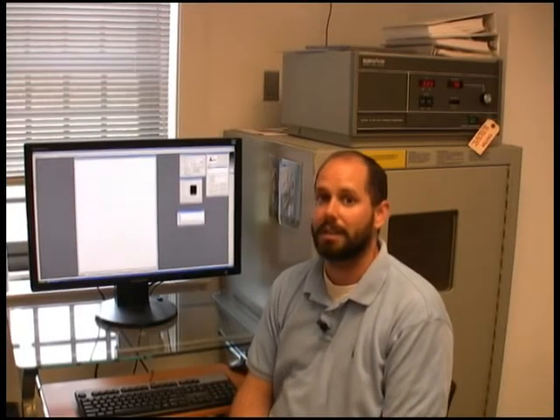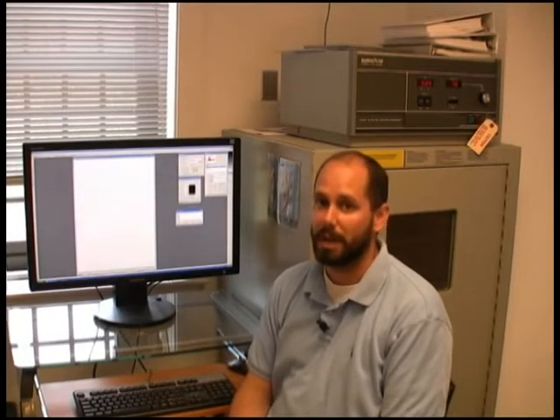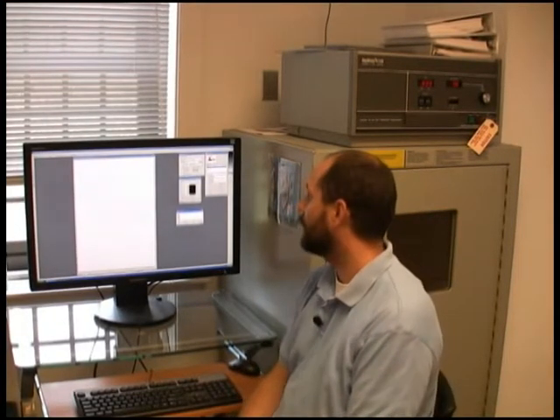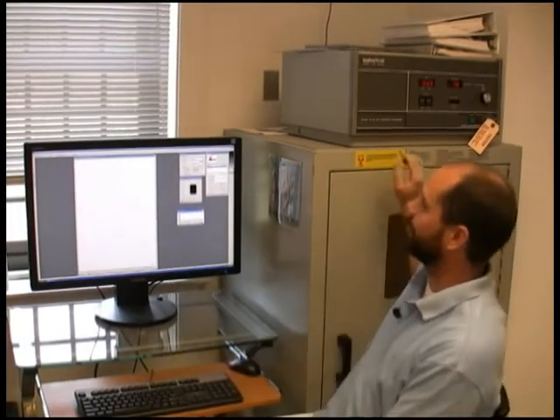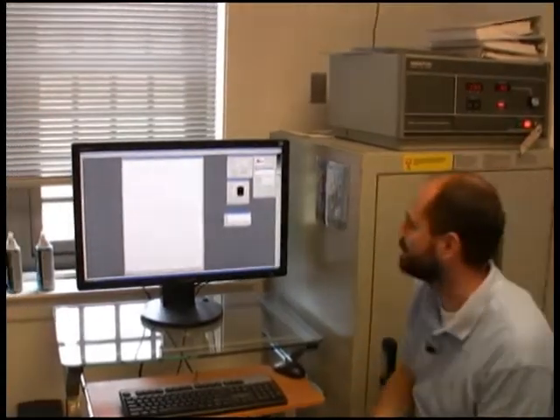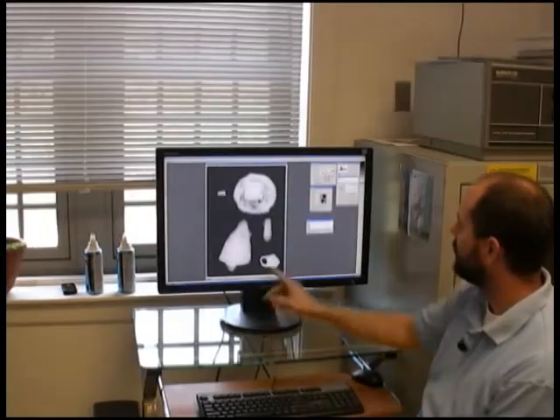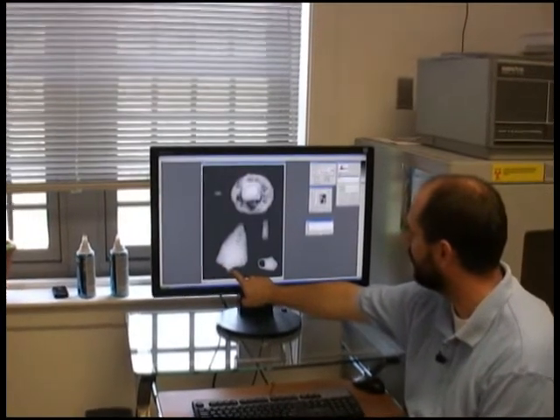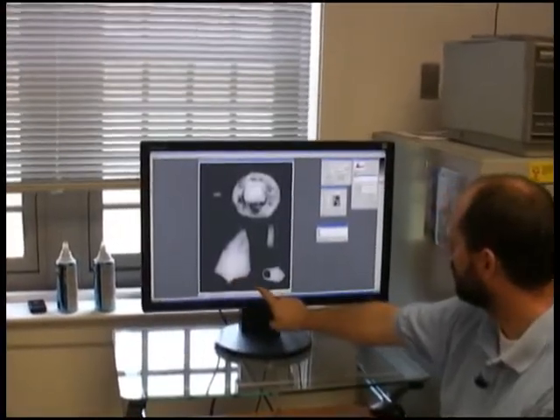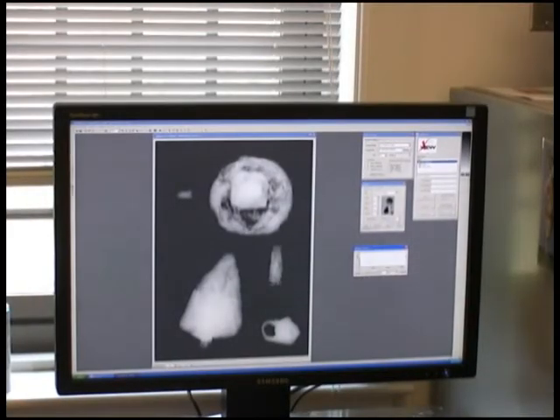Digital x-ray allows us to get a sneak peek through the artifact, helping with identification, conservation treatment methods, and what we want to actually do with the artifact. As you can see on the screen, here's the mason's trowel, and here's the ball lock — we can get a little bit better view on this.